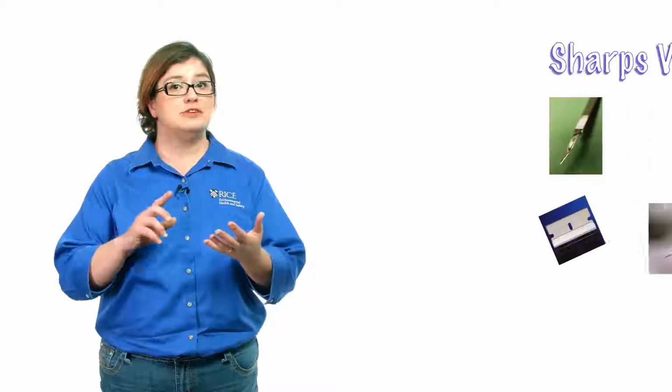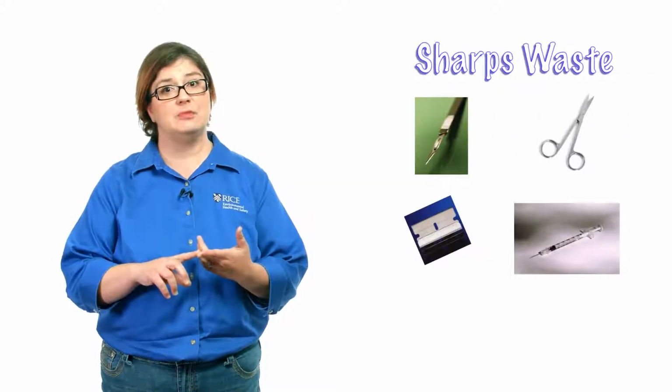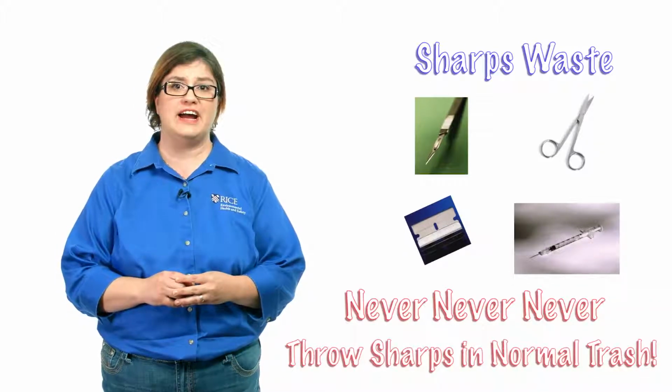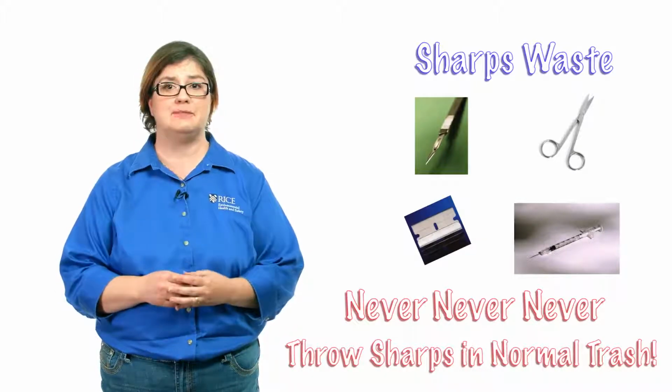One special type of waste that we need to talk about are sharps. This is another way of saying sharp objects. These include broken glass, razor blades, syringes with needles, and scalpels. We never, ever, ever throw these away in the normal trash. It could put our custodians at risk whenever they come to collect the trash from the laboratories.